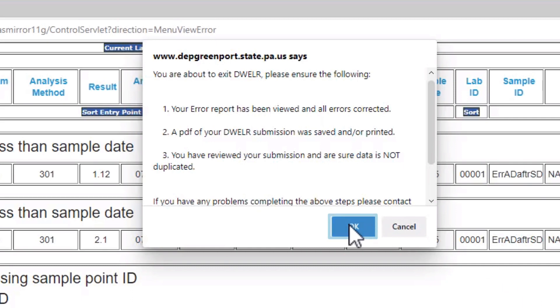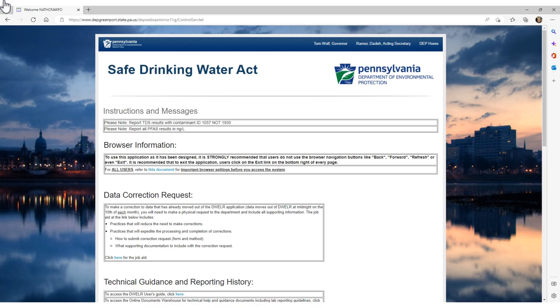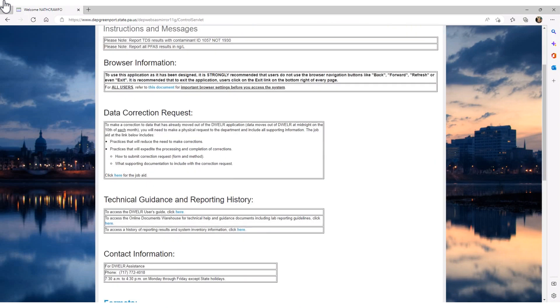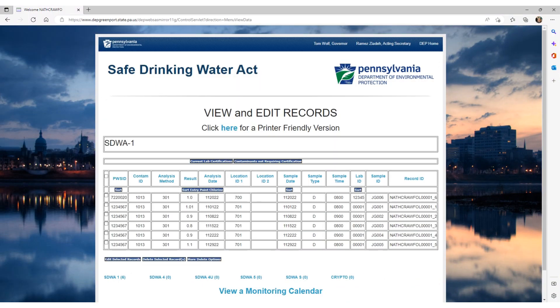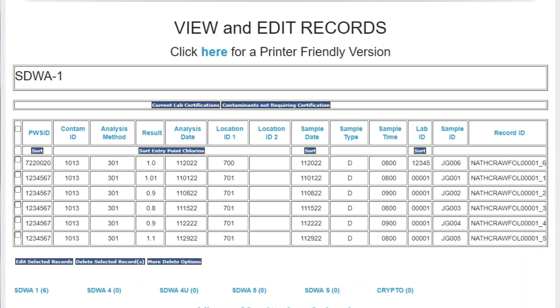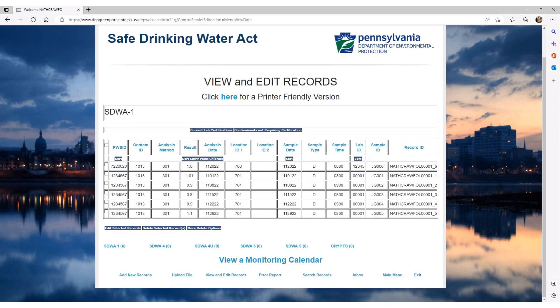The second to last DWELLR feature we will talk about is how you can check your counts to verify that you have entered all of your records and not duplicated any. After you first log into DWELLR, but before you add new records, scroll down and click the View and Edit Records button. On the View and Edit Records screen at the bottom, we can see that for the current reporting period, there are currently 6 records entered for SDWA-1 and 0 records entered for SDWA-4, 4U, 5, and S, and 0 records for crypto. Now we can scroll down and click on Add New Records.